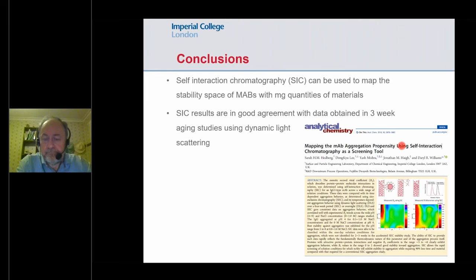Okay. There's one more question in connection to the first one. Naveen is asking, so in this case, the column will be packed with powder polymers, for example, and maybe water that contains protein can be fed. So maybe I have to repeat that again. Are we talking about inverse gas chromatography? So the first question was that can we use solid polymer as filling media in the column and feed protein?